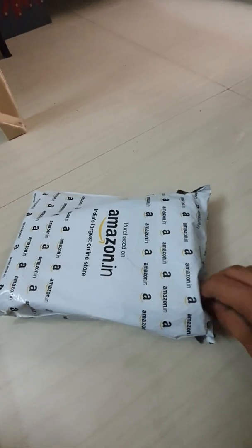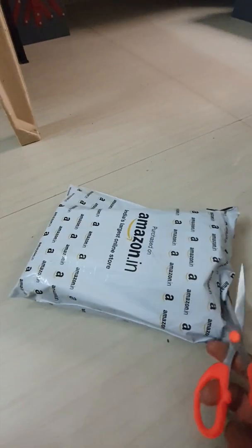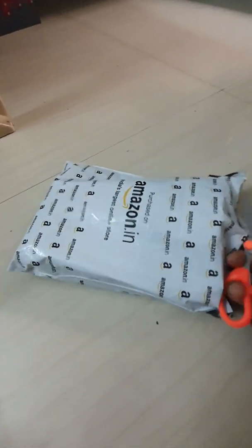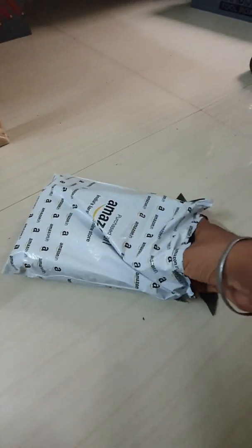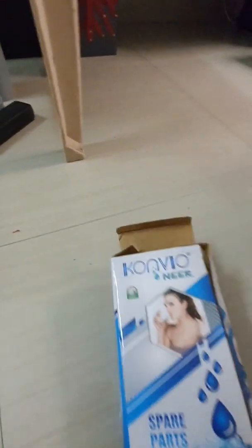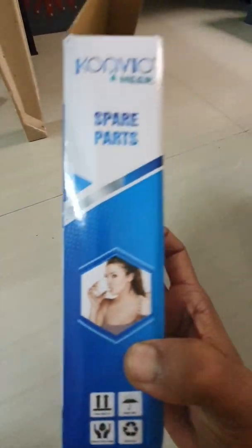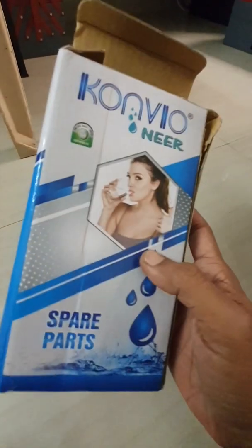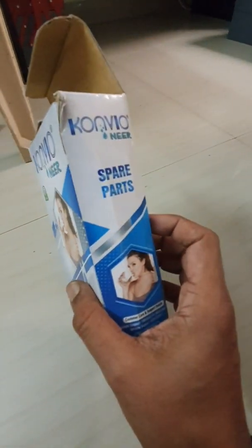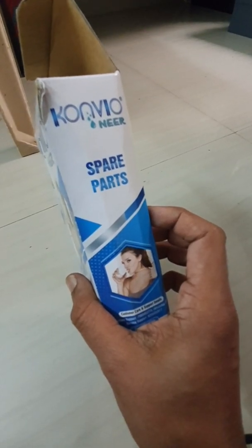This pH meter has a range of 0 to 14 and is highly accurate. It has a good review. Here we have the box — Konvio Neer Digital pH Meter — and it can be used for testing various types of water. It's highly recommended for hydroponics or aquariums.